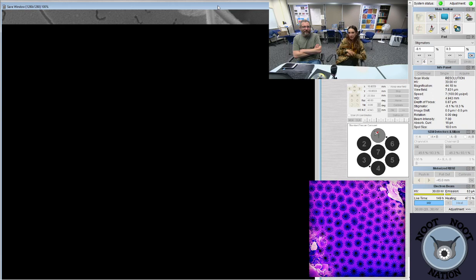It's got some really cool pores on that Gomphonema. Yes. It's a nice shot.